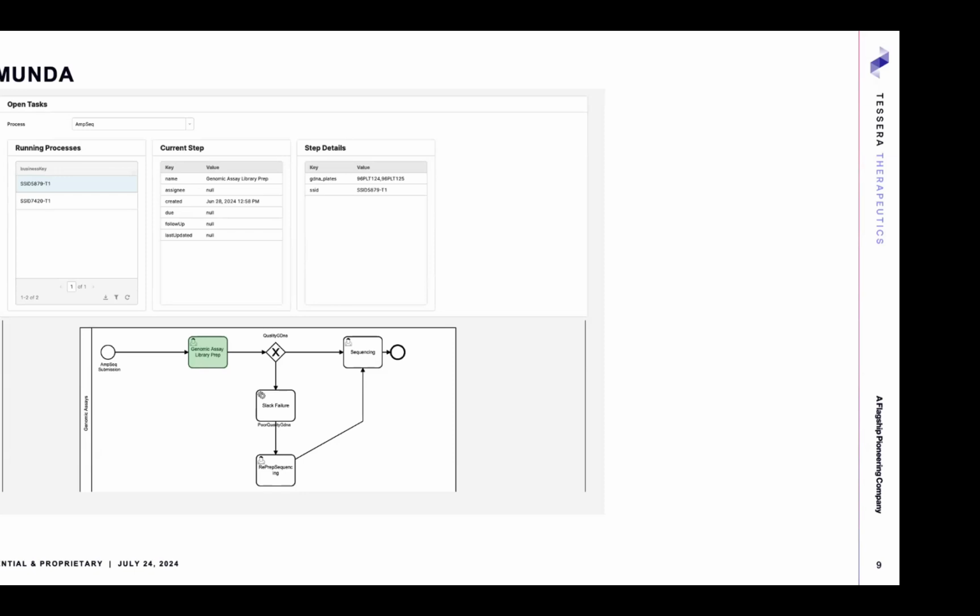They can be API tasks, or they can be like service tasks. So each of these different types of tasks you can track. And one of the nice things about it is if things go through this process, through the steps of the task, it records start times and stop times. So if you're in an environment that you're doing borderline manufacturing, turnaround time is one of those things that people always want to know. So this will track all the turnaround times for each process and step.